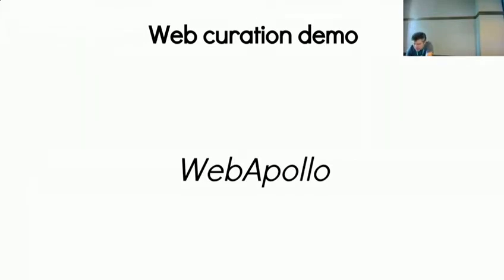So the idea is that you can go in and I can edit a region here. I have the region in both places. If I go in and edit it in one place, you'll see the change occurring immediately on the other side, hopefully.